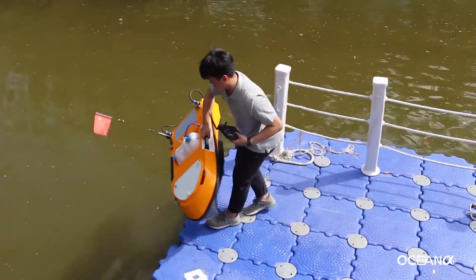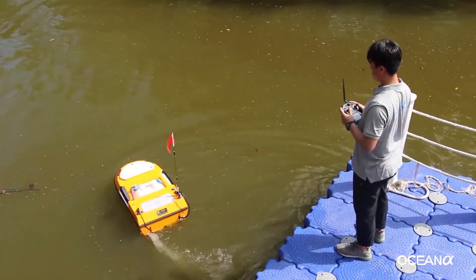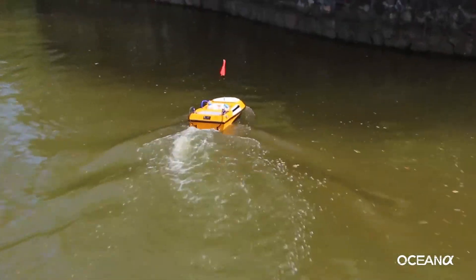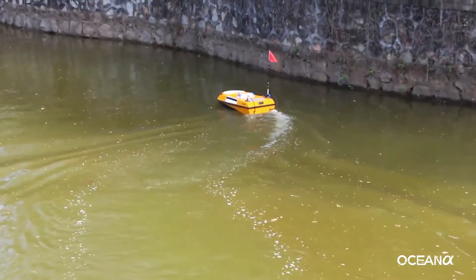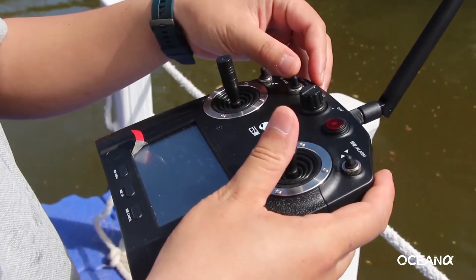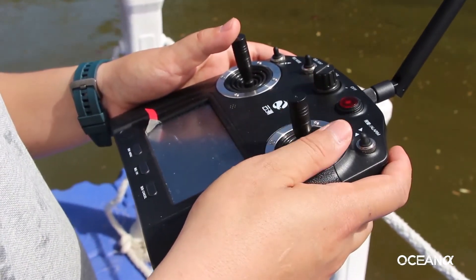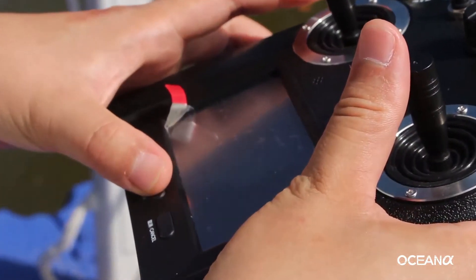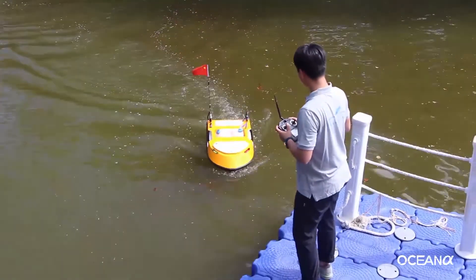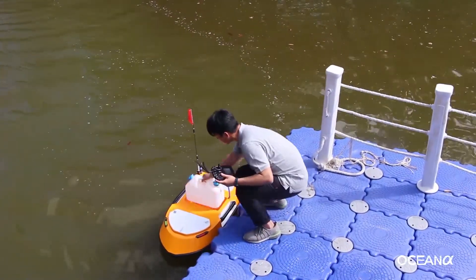Lift and place the USV on the water surface. Direct the USV to the sampling location. Push the sampling button when the USV reaches its destination and choose the sampling amount. Push the confirm button to monitor the sampling process. Direct the USV back to shore after the mission is accomplished. Take out the sampling bottle and retrieve the USV.